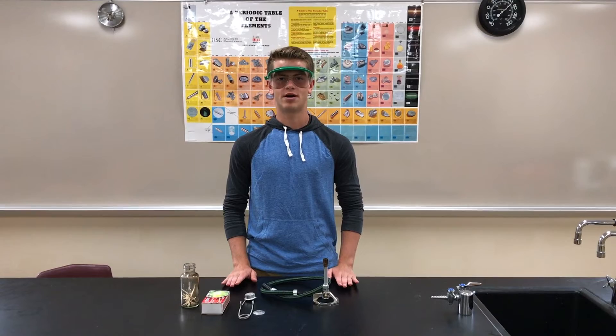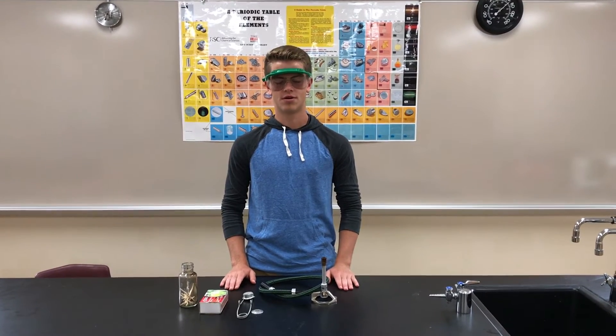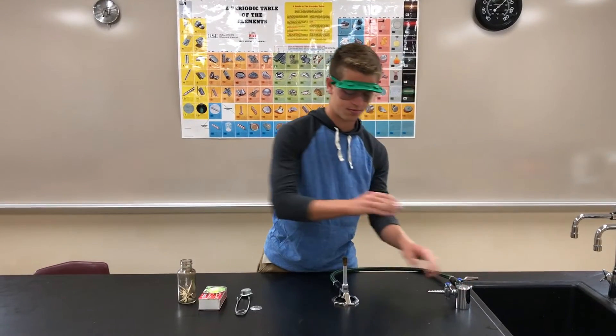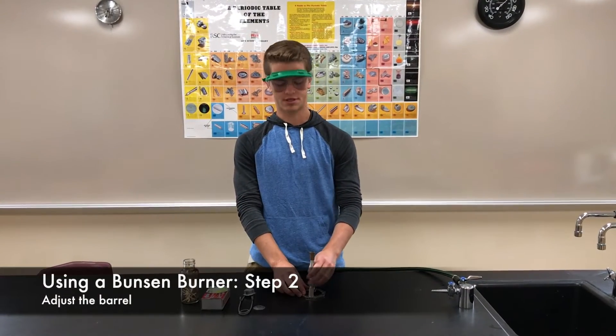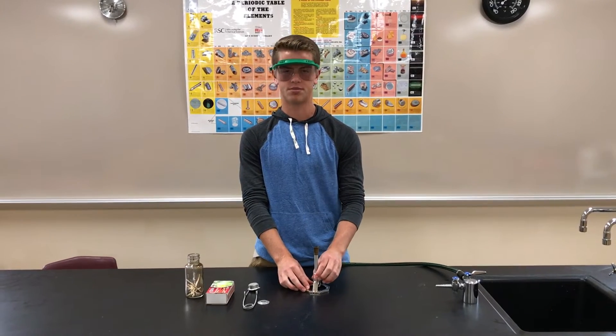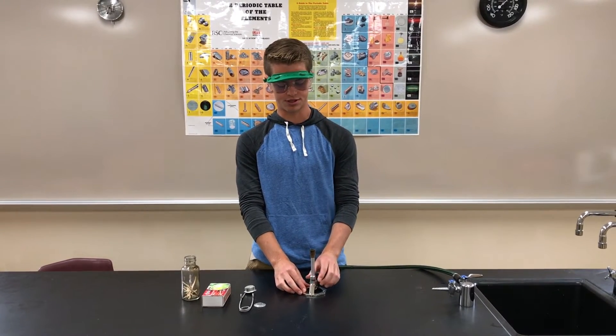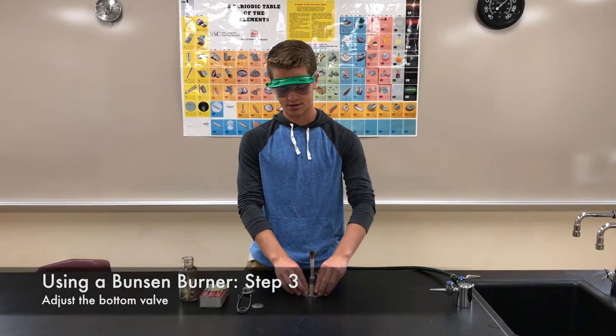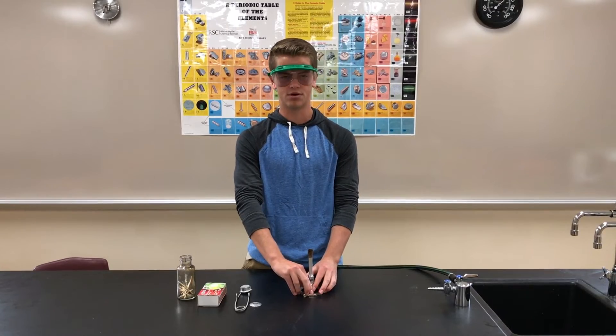Now I am going to show you how to safely light a Bunsen burner. First, take the hose and connect it to the gas line. Second, twist the barrel until it is completely shut and then twist it back the other way about one full rotation. Then twist the gas valve at the bottom until it is completely shut and then twist it back about one full rotation.